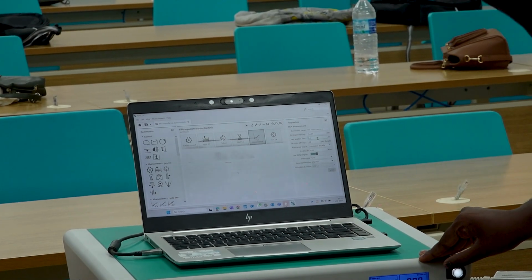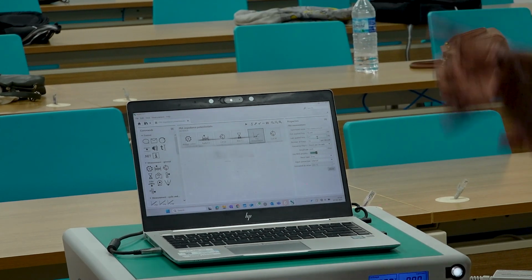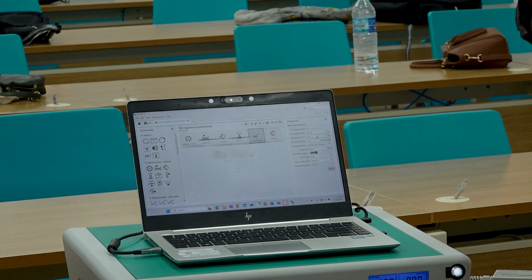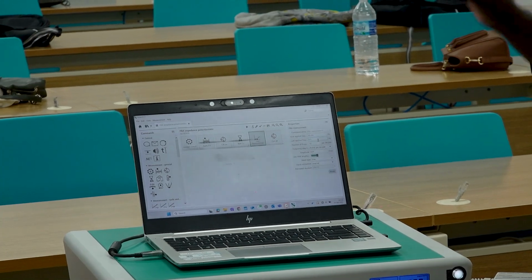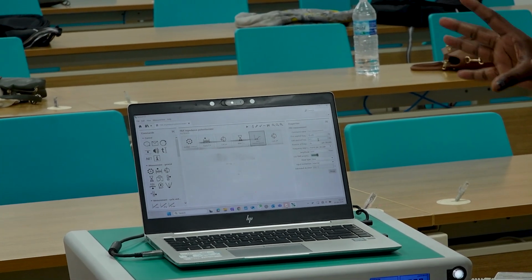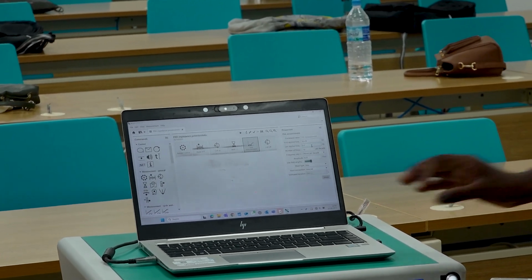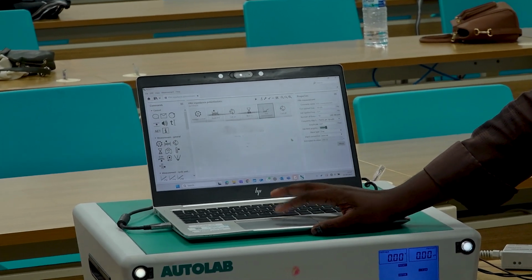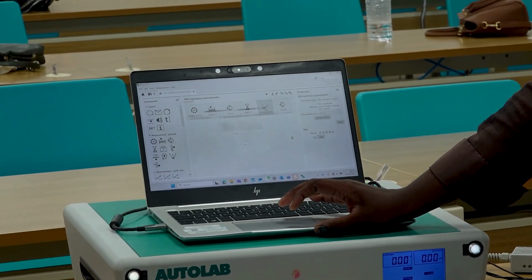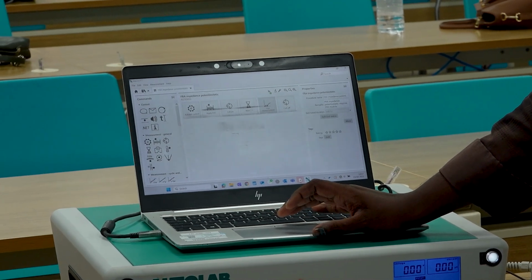You should know this conversion, because most instruments use decimal forms only, with no direct unit. If I want to apply 10 microhertz, you have to put in 0.00001 like this. You have to remember these decimal forms. So we are going to sweep from 100 kilohertz to 0.1 hertz. That's it. Is this sine wave or frequency? Frequency. Okay, so let's start.